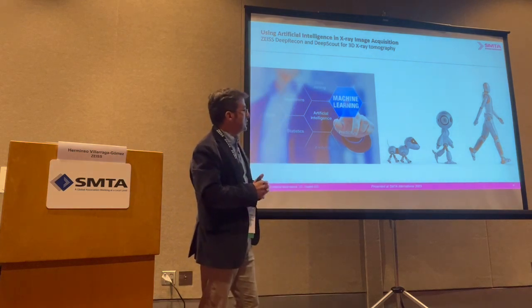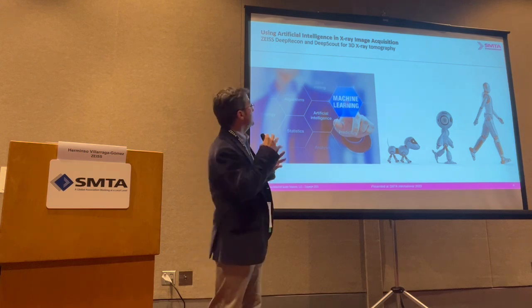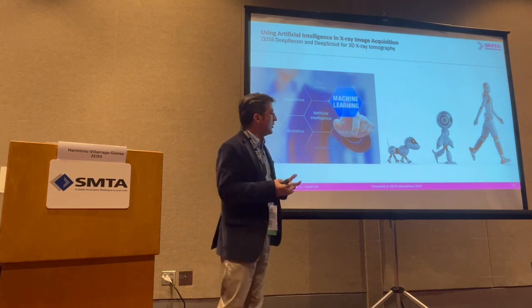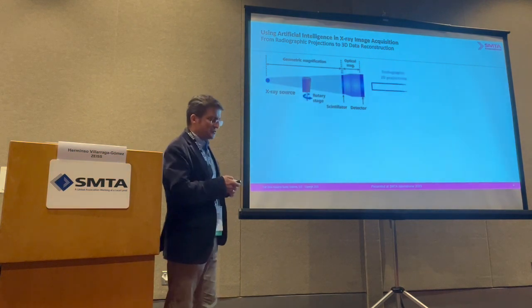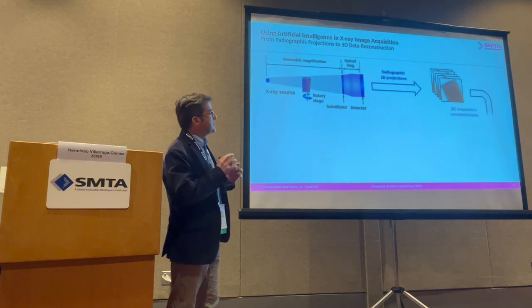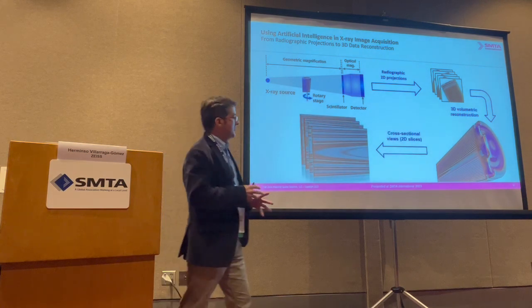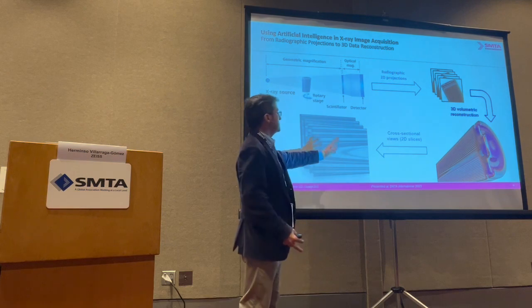Okay, so that's the beauty of the technology and some techniques we have used to improve it. Now I'm going to tell you how we are leveraging machine learning to improve even more the way we are reconstructing. And to do that, I want to make sure that it's clear where we are using machine learning. A lot of people use deep recon as a post-reconstruction processing.